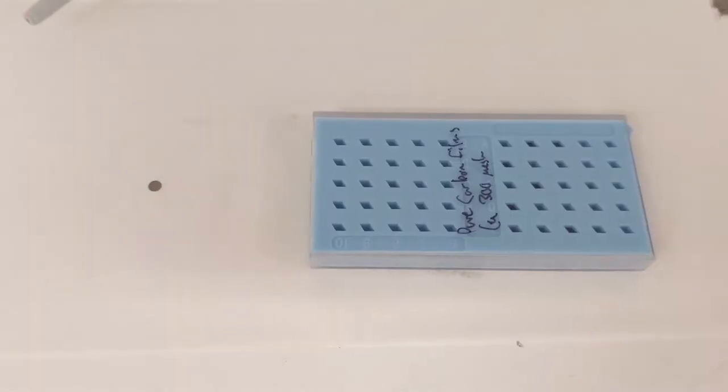So what we're going to do is dilute your sample with just water, and then sonicate it. By the end of this, we should have a homogeneous solution with the nanoparticles evenly distributed and no clumping or aggregation of the nanoparticles. And then we're going to take 20 microliters and drop cast that onto the TEM grid, which will hold the specimen so that we can put it into the TEM and image it. So let's take a look at the tools that we'll need to do this.